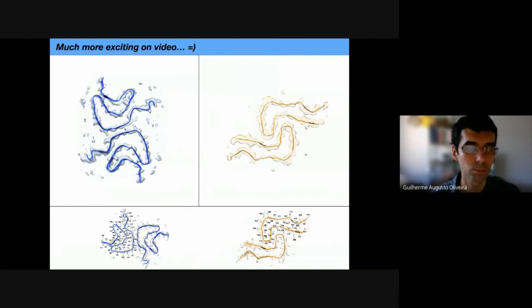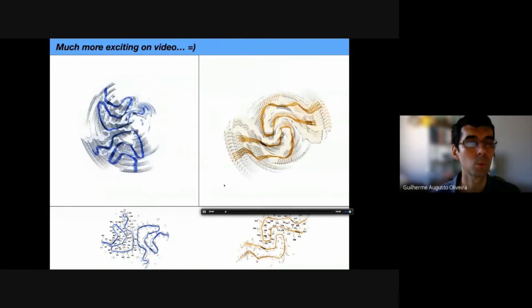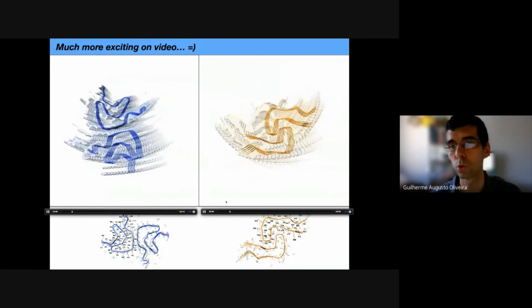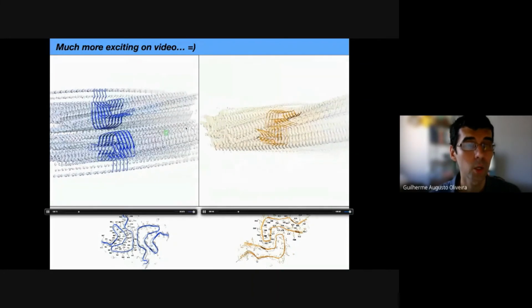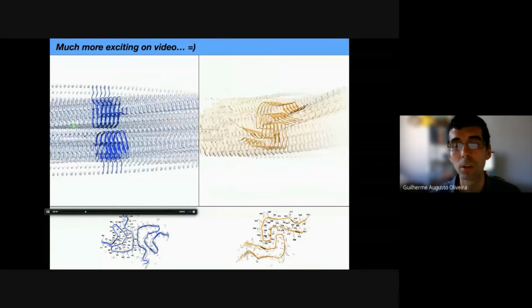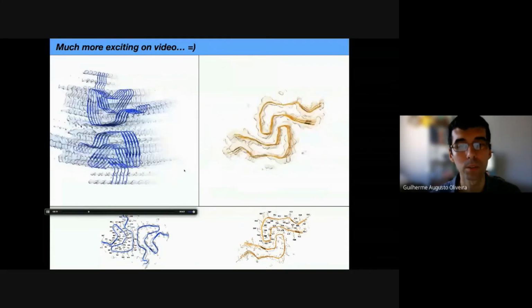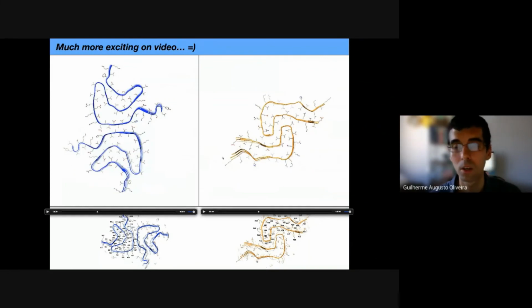So this is pretty challenging for me, but let's try to play both movies at the same time, so we can see both polymorphs, the rods in blue and the twist in orange. Here you can see the cryo-EM densities for both amyloid filaments, and the atomic model that you can build from the cryo-EM maps. Maybe I should stop the video right now to show the side chains right in here. Okay, so let's play them individually now.